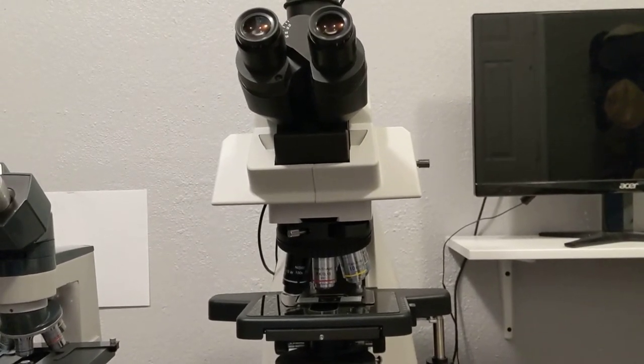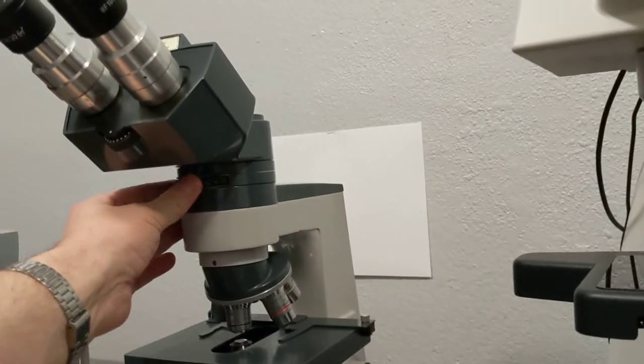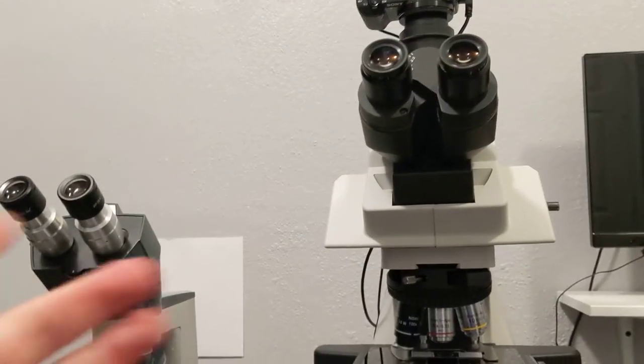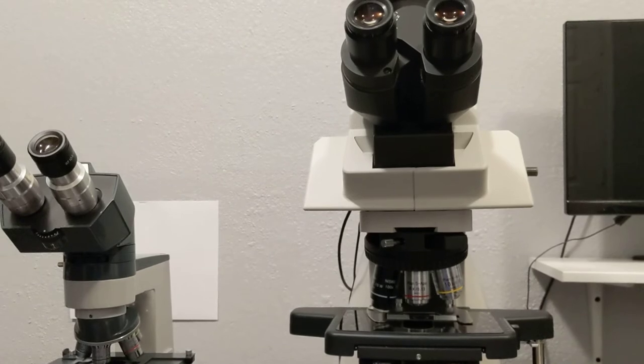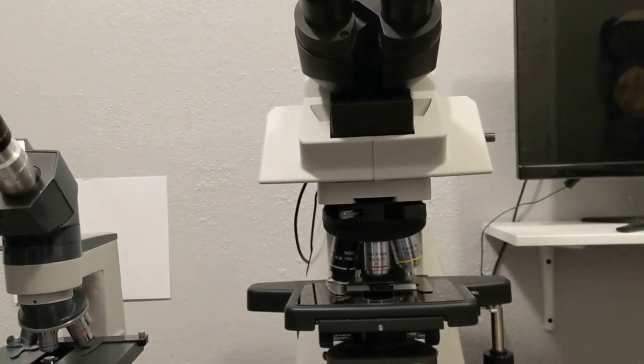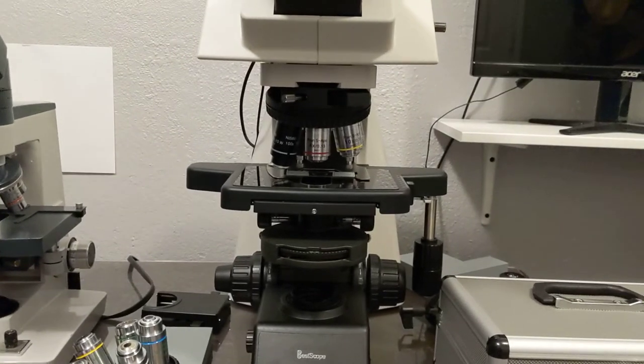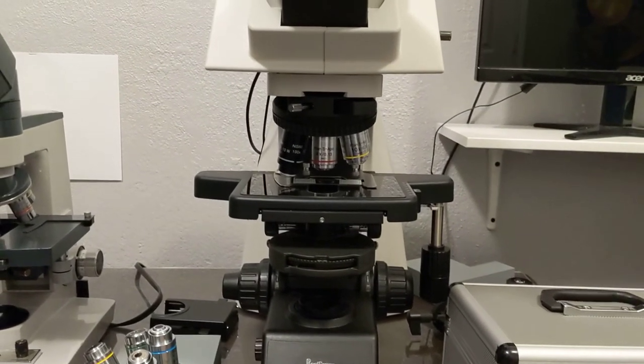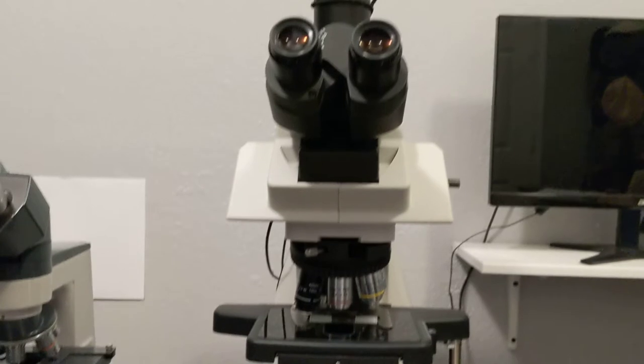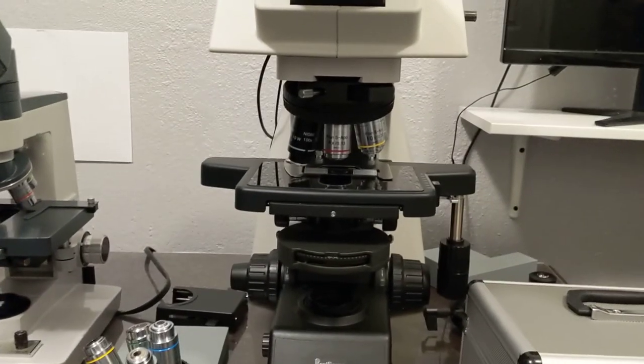That's something I miss from the American Optical systems. On my American Optical, I've got this rotating insert that you can put polarizers in. It'd be nice if I had that here because it's really convenient. I don't really like having to slide something in there. With DIC, there's a different prism for low magnification versus high magnification. They just put a slot here, and they save themselves having to manufacture all kinds of other things.